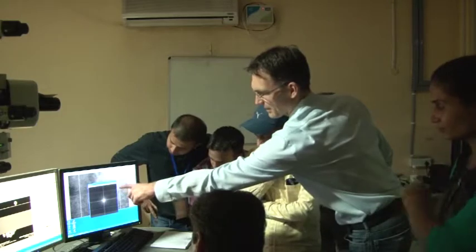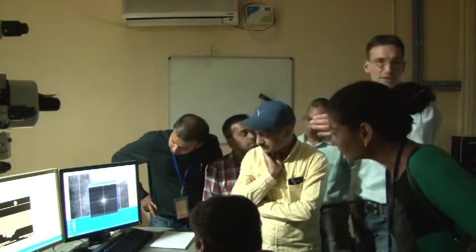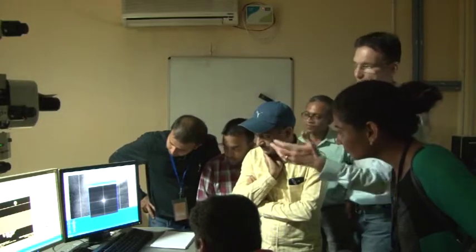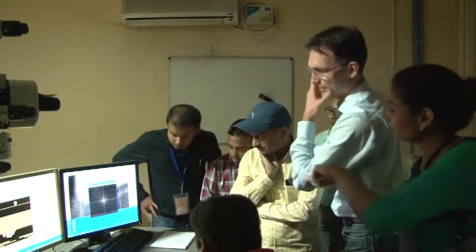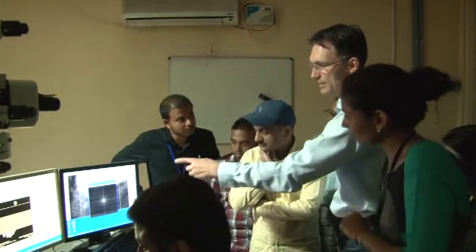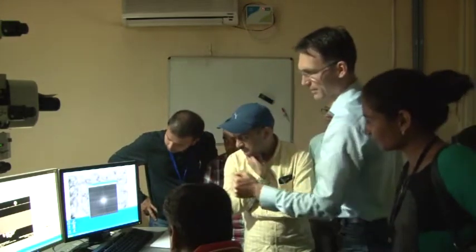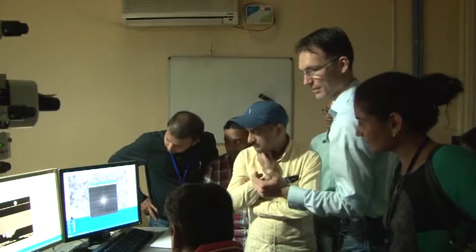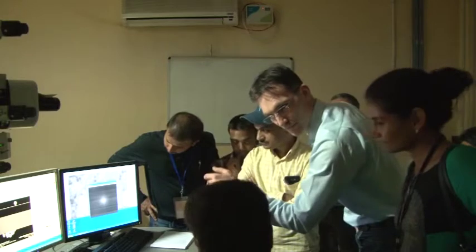Now you see the astigmatism again. So there's the overlap of this. No, these are not the reflections, like the reflection pattern. No, the rings are just due to the contrast transfer function of this ellipse. Why does it actually show up in the image for the FFT?